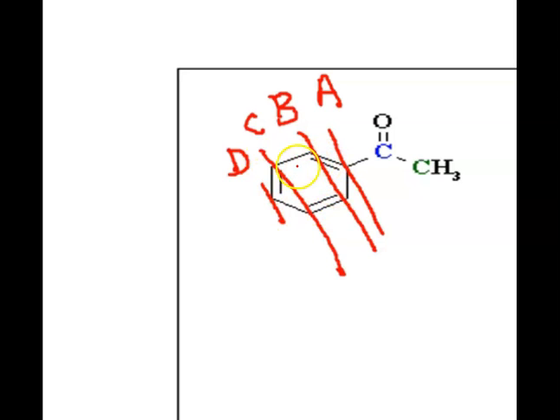So while these 3 inside alternating double bonds make it look like they're not the same, they actually are. You have to remember in resonance that these double bonds are alternating. So while we draw it here, in these positions, then they alternate. In other words, that resonance structure is actually a variety of versions here. So let's just suffice to say that carbons B, at these 2 junctures, are actually identical.